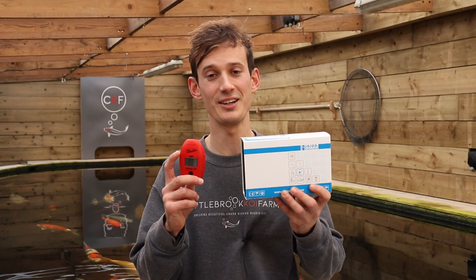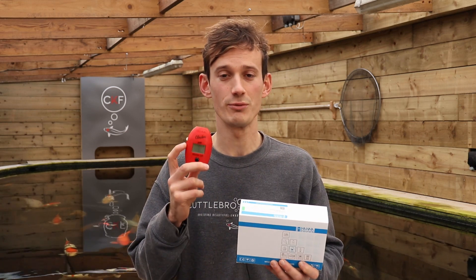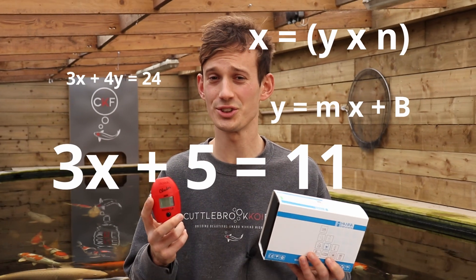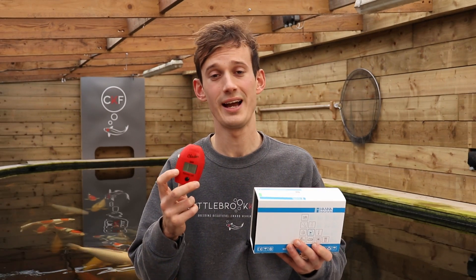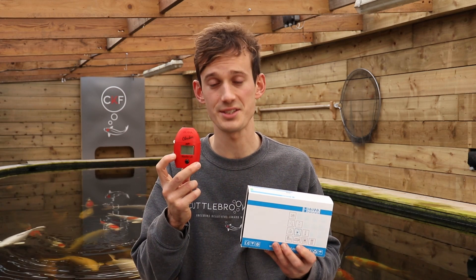Hi guys, Sam here from Kochepot Koi Farm. I'm here today to show you how to use the HANA low-range nitrite test kit. This is certainly one of the more confusing of the HANA pocket test kits as it doesn't give you a result straight out of the meter. You've got to do a few calculations and a lot of people get confused by that. So fingers crossed this nice and simple video will help you understand how to use the pocket checker, how to use the calculations and what those numbers actually mean for you and your fish. Stay tuned, hope this is a nice and simple easy guide of how to use this fantastic little bit of kit.